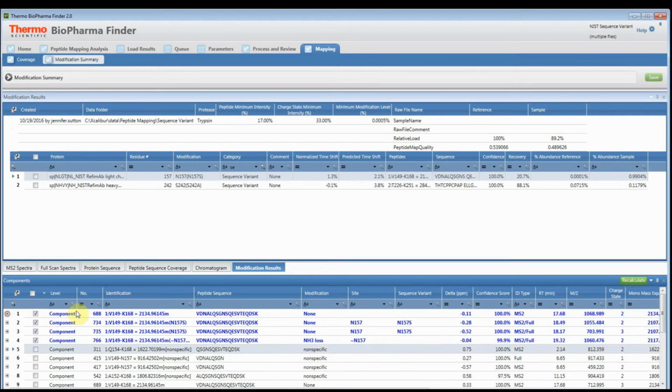Let me go over that again. The percent abundance for the reference file, meaning just the reference raw files, is going to sum up the MS area from the reference files for the modified, which would be these two, and then divide it by the sum of all of them. So it's going to use all the ones that were in blue. That's how it's actually doing it. And it does that for both of the two different conditions, and then you get a value.